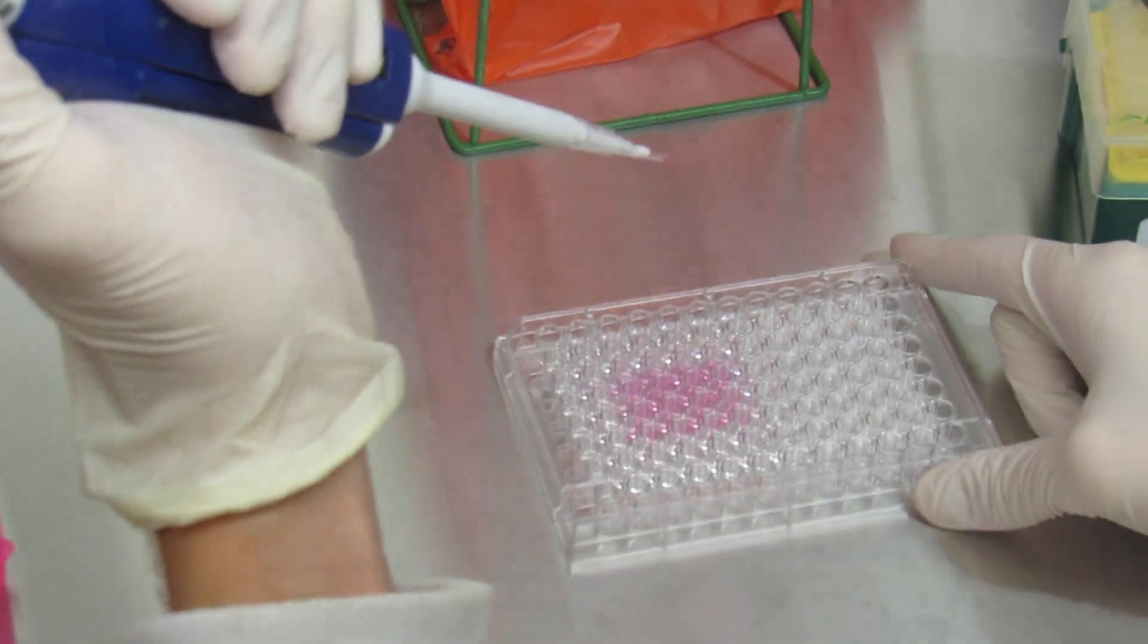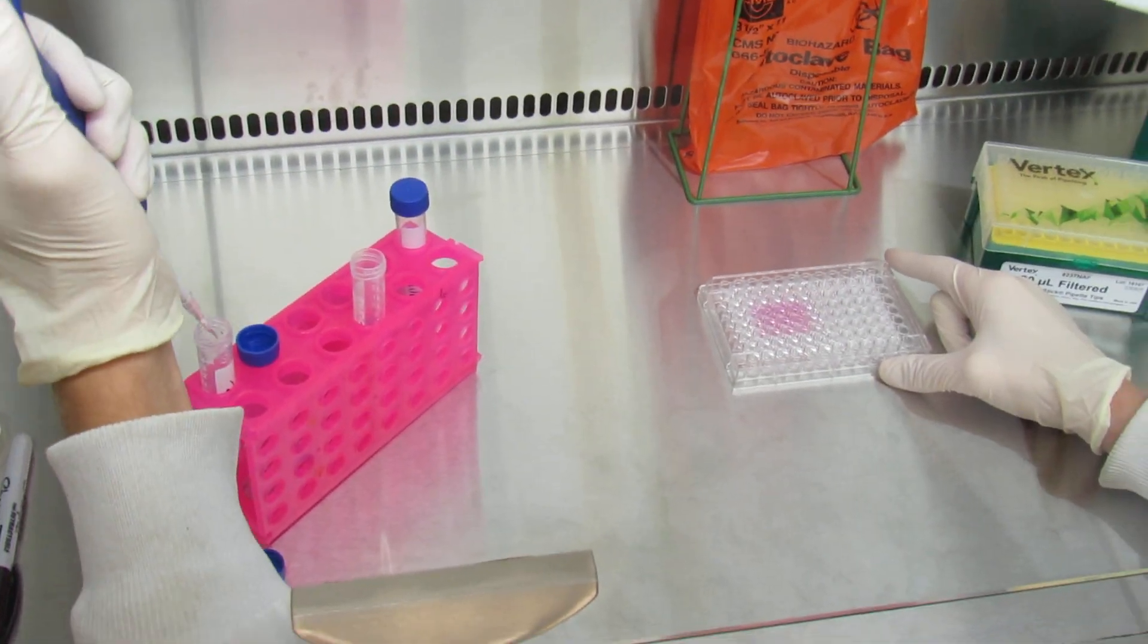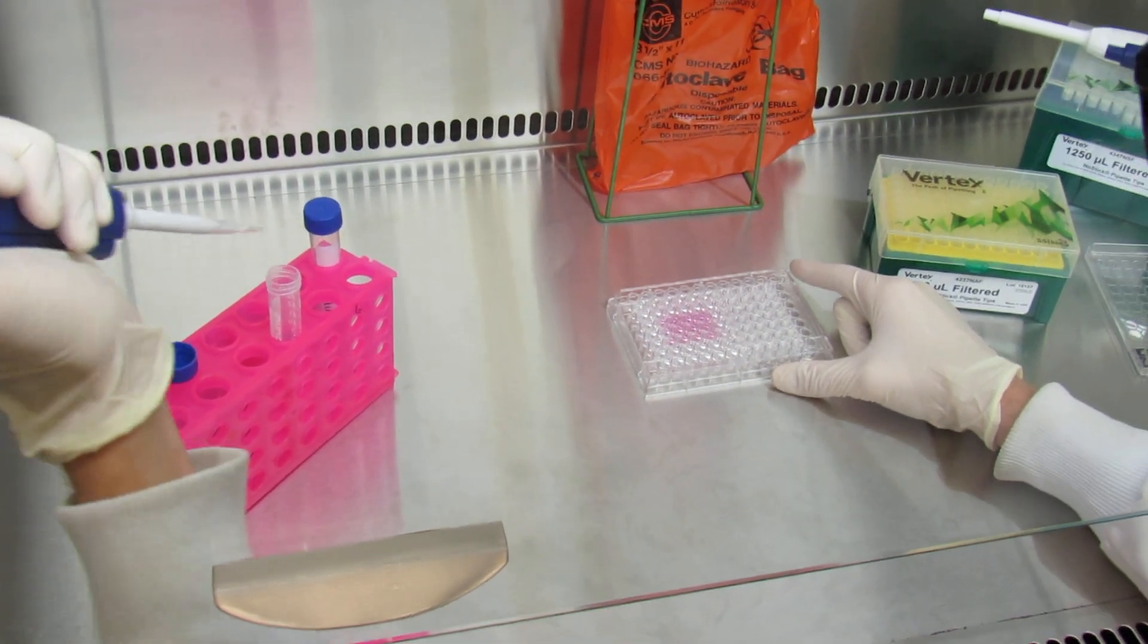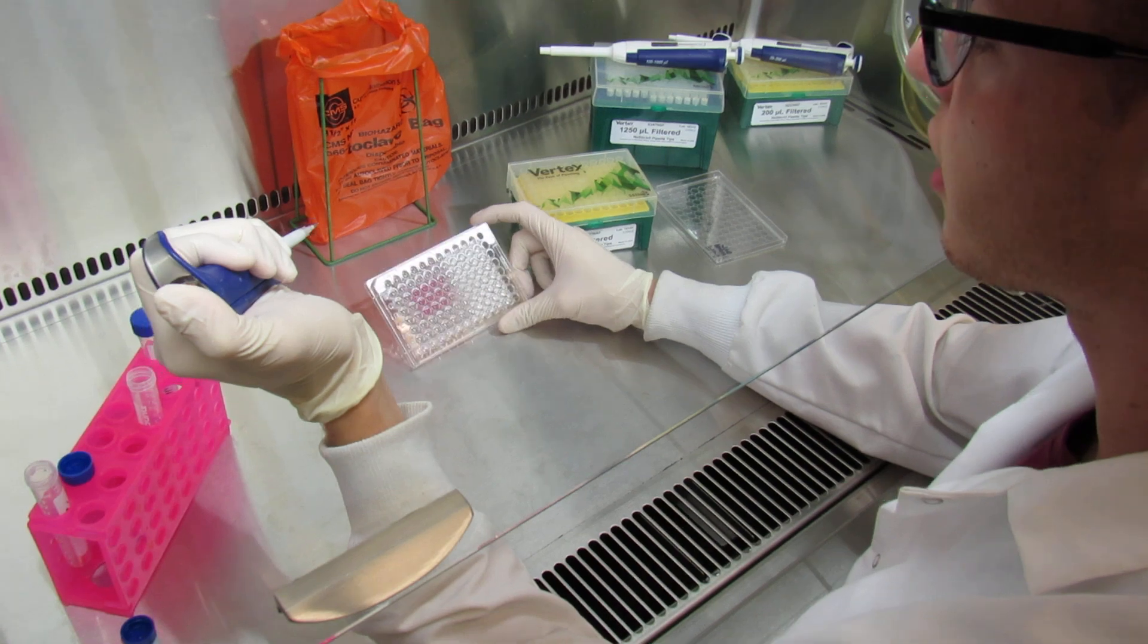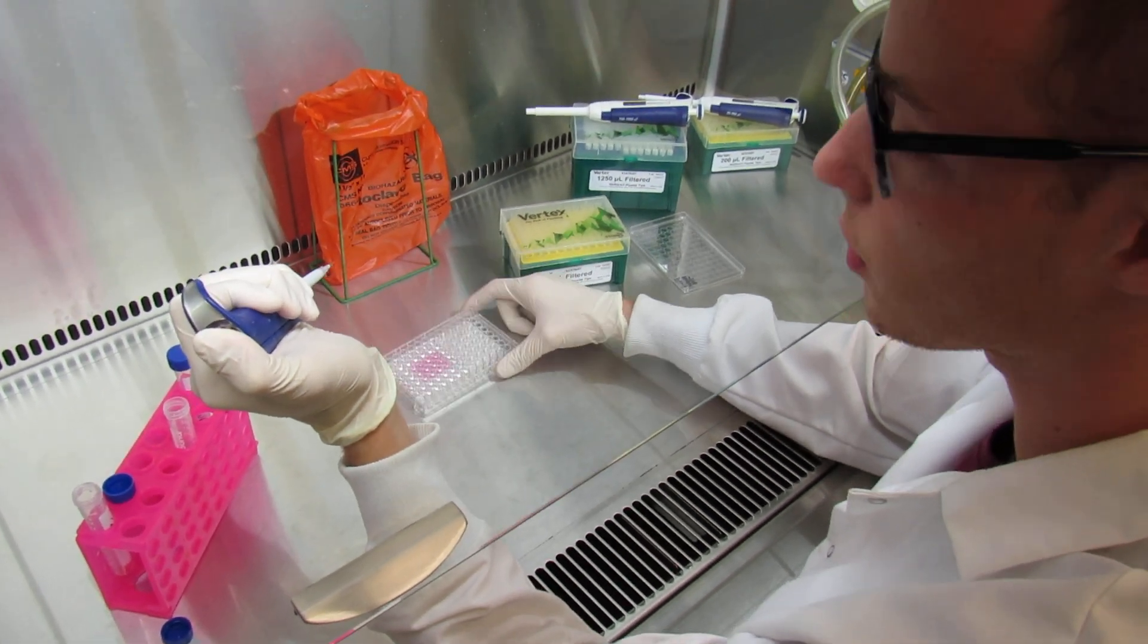Take the last 10 microliters from that last well and put it in the waste. You're going to repeat the step for all of your samples, so you're going to successfully serially dilute your samples.